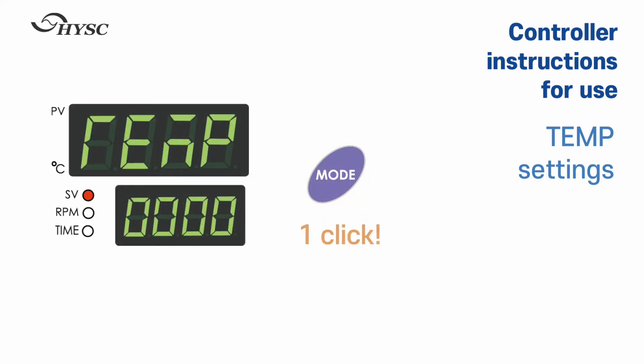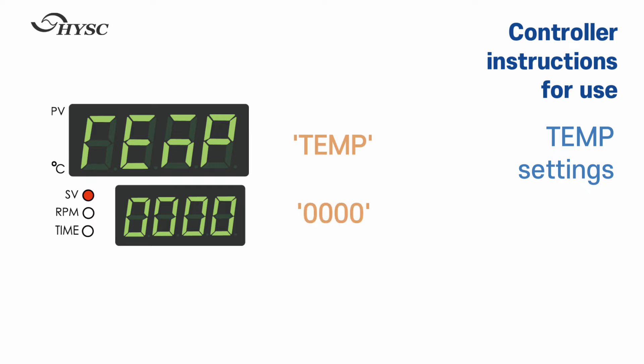Press mode key once. Temp is displayed on the upper screen. Temperature setting is available on the under screen.